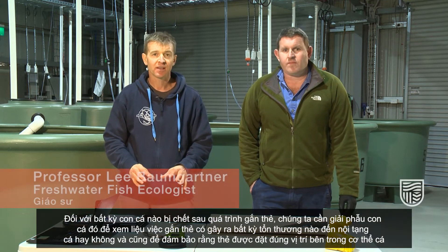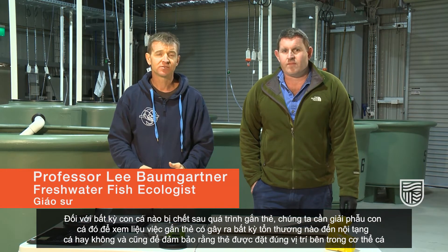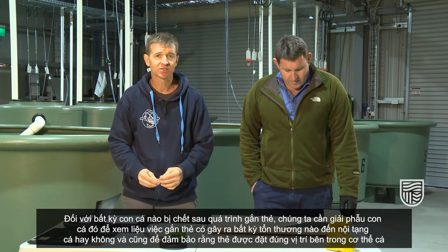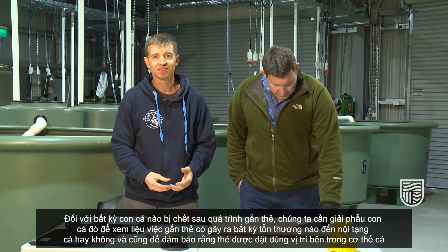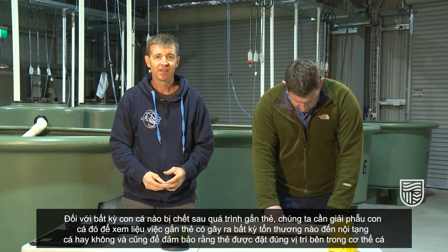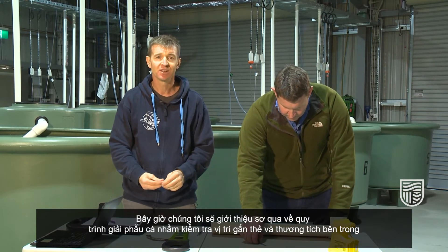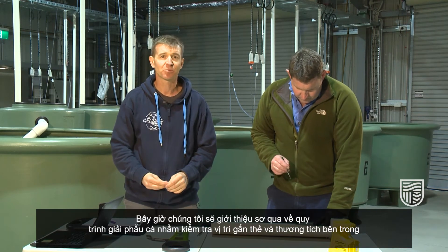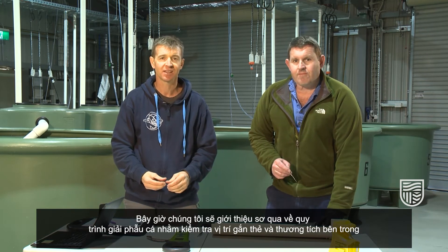For any fish that die following the tag insertion process, it's always good to perform an autopsy to check if the tagging procedure has led to damage of any internal organs, and also to make sure that the tag has positioned correctly inside the fish. We'll run through the standard process now of performing an autopsy on the fish to check for tag location and internal injuries.